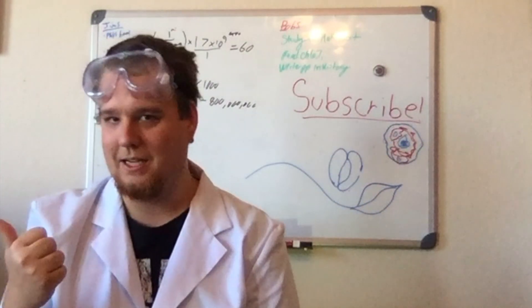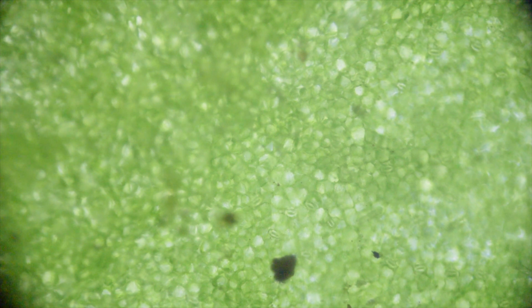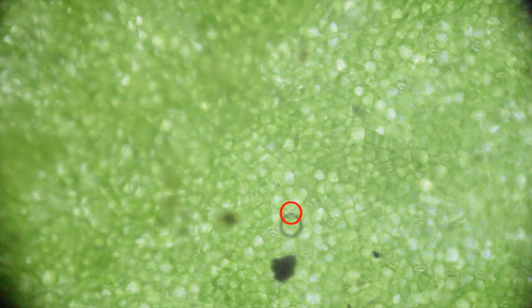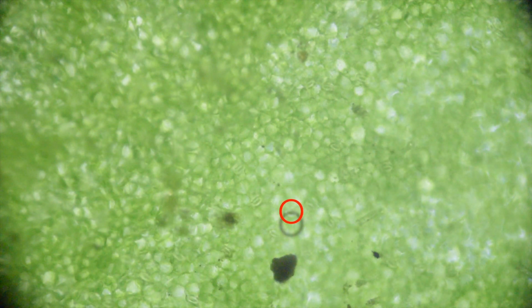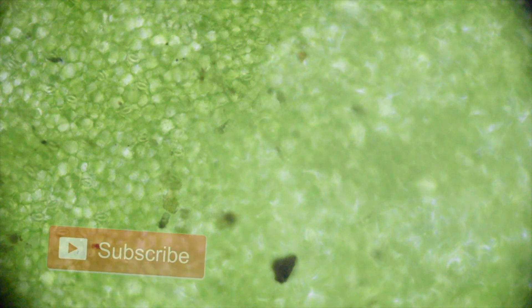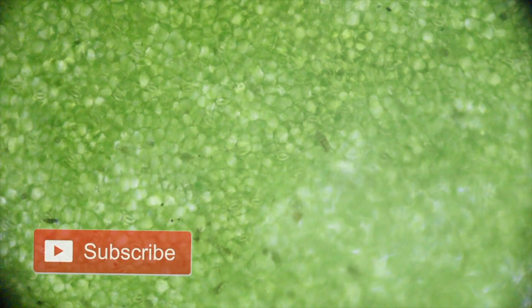So let's take a look. Alright, so right here we can actually begin to see some of the stomata at about 40 times magnification. We're actually looking at the guard cells because the stomata are actually the holes. The guard cells open and close and they allow the plant to give us oxygen and take in CO2 to make oxygen.